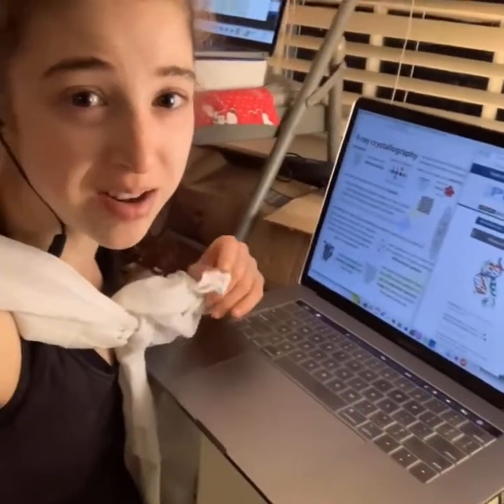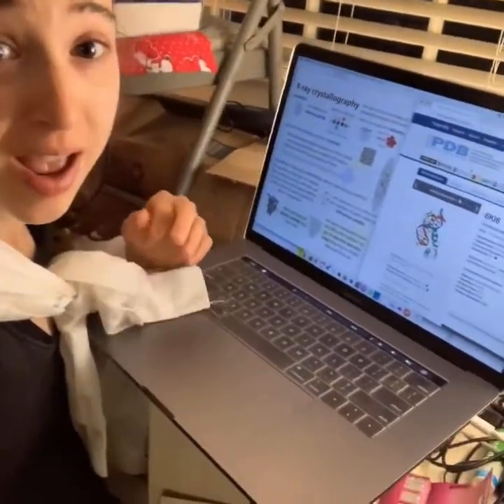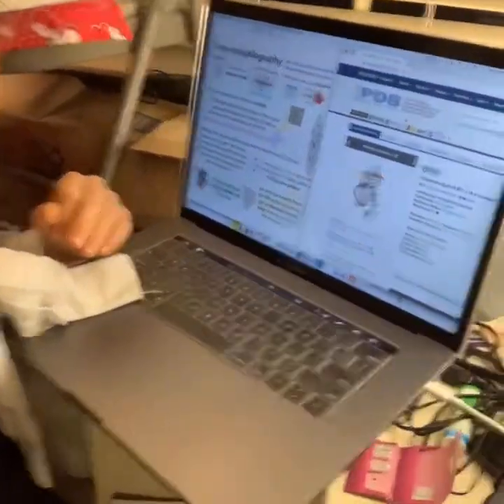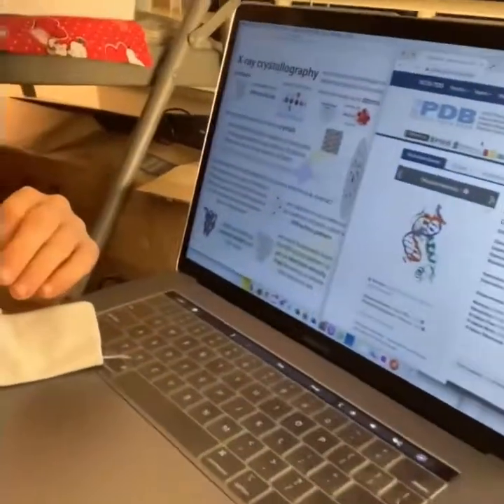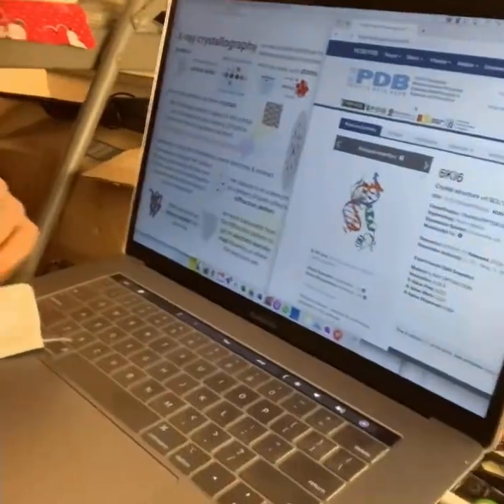Today I want to show you how you can use the PDB to look at what proteins look like.